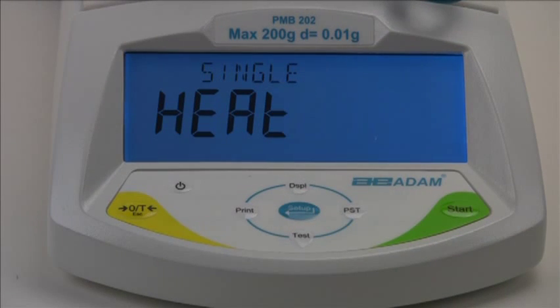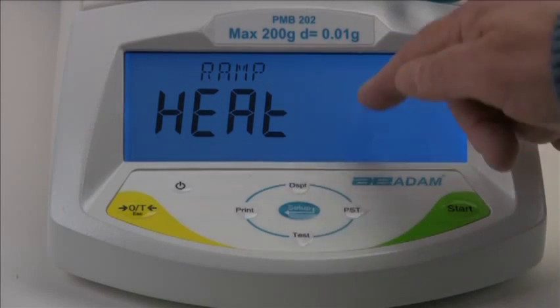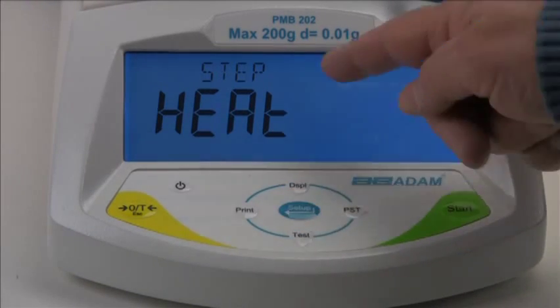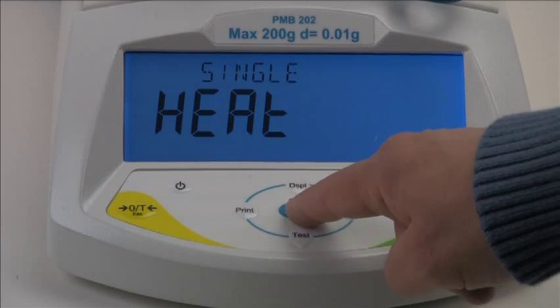Now we need to select a method of heating. The PMB offers three methods: single temperature, to heat your sample to a set temperature; ramp, to gradually reach your final temperature in a specified amount of time; and step, to use up to three different temperatures during the test. We'll select single for our test by pressing enter when single is displayed.